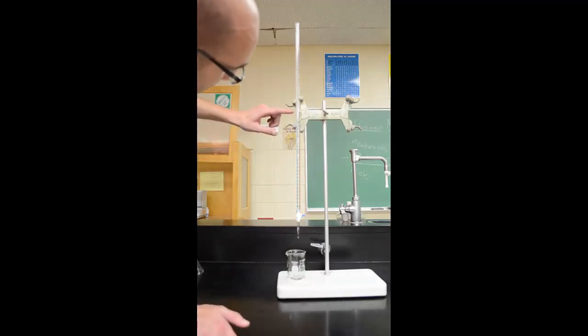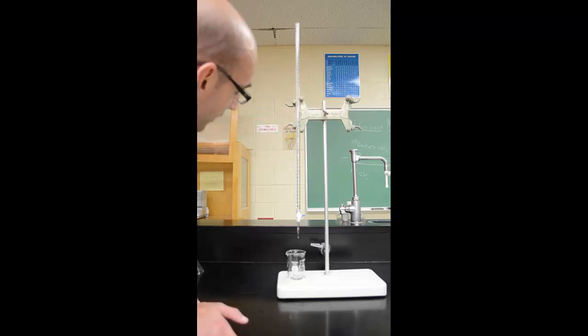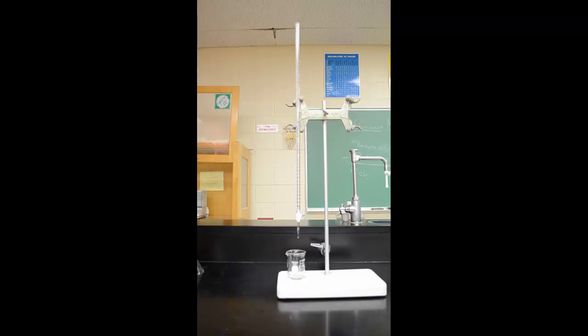I will turn this off and make my final volume reading. So 25, 26, 27, between 27 and 28 I would read that as 27.70. That's the number that I would substitute in as my final. Final 27.70 minus my initial number, and that is the volume delivered to my beaker.